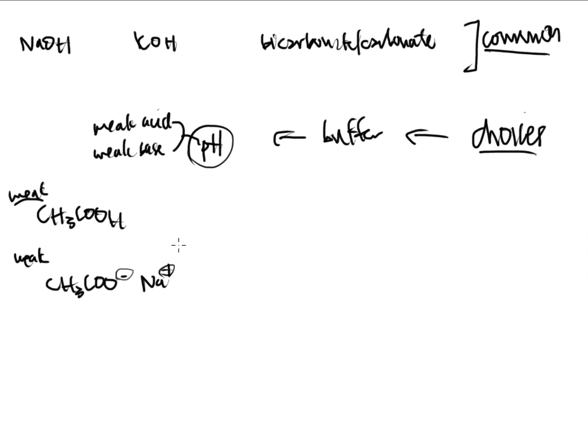But let's say that I'm required, because I'm a lab technician or an entry-level chemist or a laboratory worker, right? So let's say that I'm required to make my own buffer, and I'm going to have to come up with my own recipe. I should be able to know how to do this kind of thing, right? So if I'm required to make my own buffer, what I have to understand is that there's an equation out there. And that buffer is probably made to get you around a certain pH level. And as long as we stay at that certain pH level, then we have control of whether or not these ions are really ions. I've got control of their charges.